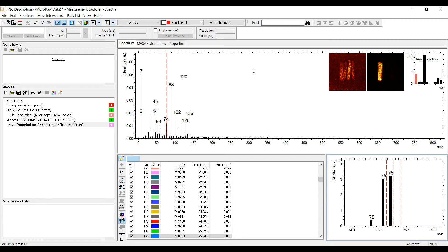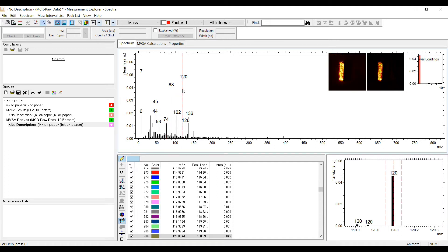For further interpretation, the loadings have to be looked at together with the score images. In the spectrum program, the loading plot shows that, for example, mass 120 has a high contribution to factor 1. The comparison of the score image here in the middle and the secondary ion image on the left shows that they do match perfectly.